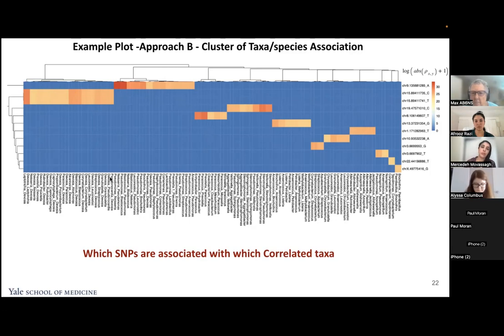You can see that most of this down here is from a genus of Devosia. Every genus has various species, but it's behaving like this across all of the species of this particular genus. You can see the same thing repeating various times, and it's of different species of that genus. And so it shows that this particular area in the chromosome has a relationship basically with this specific bacteria. Not only that, but the bacteria seem to be having relationships with other bacteria as well.